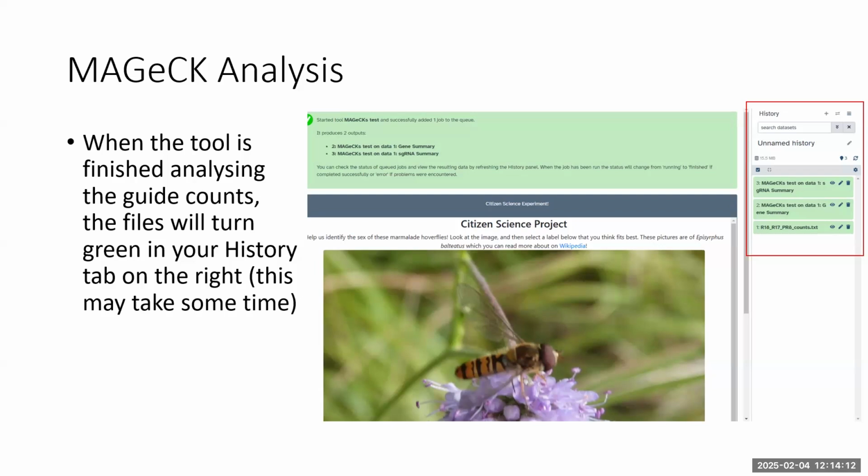Essentially, you're starting off with a transcript file, and you basically want to download all the open reading frames from a genome. So you would go on Ensembl or something like that, go to the genome platform you're interested in, and whichever release and assembly it is.